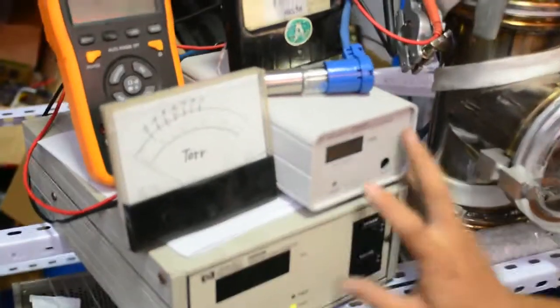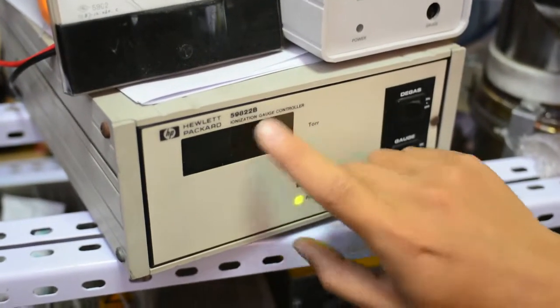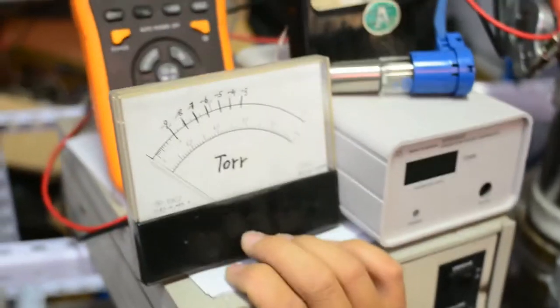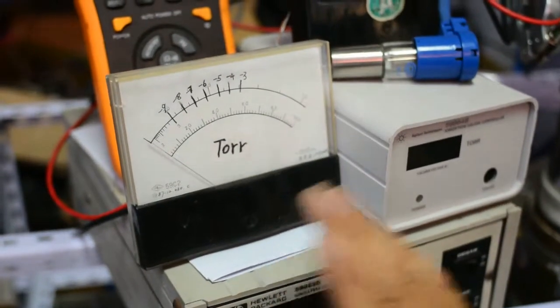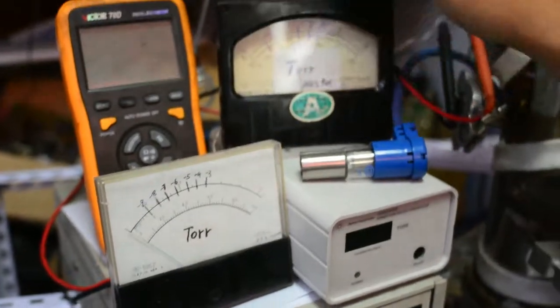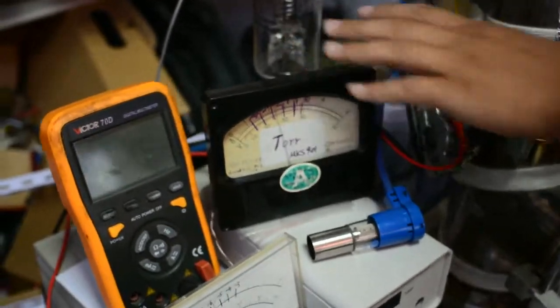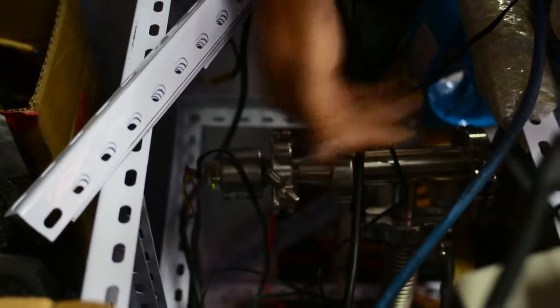This is the gauge control system. Here is a glass ball vacuum gauge made by Hewlett-Packard, and this is the display panel of the Pfeiffer vacuum gauge — it measures the analog voltage output to read out the vacuum level. This is another Pirani gauge mounted here, used to measure the roughing pressure from the mechanical pump backing up the turbo molecular pump.